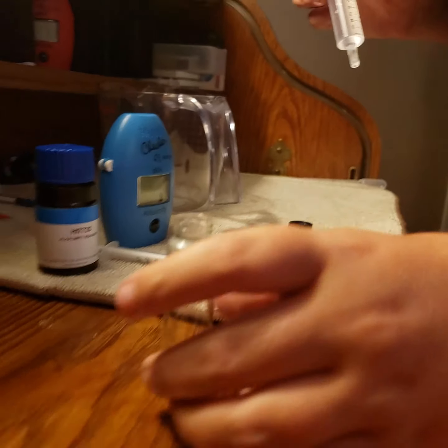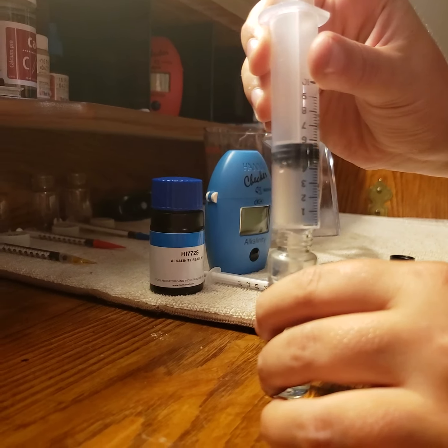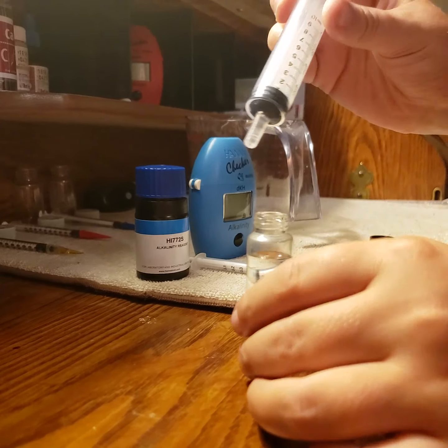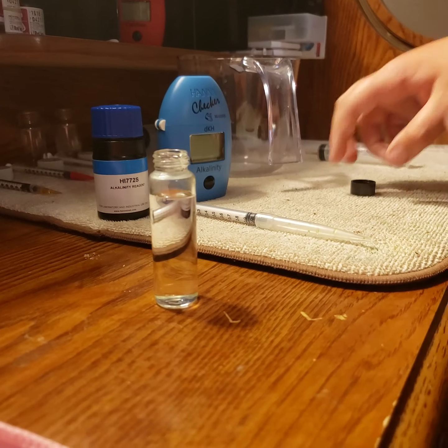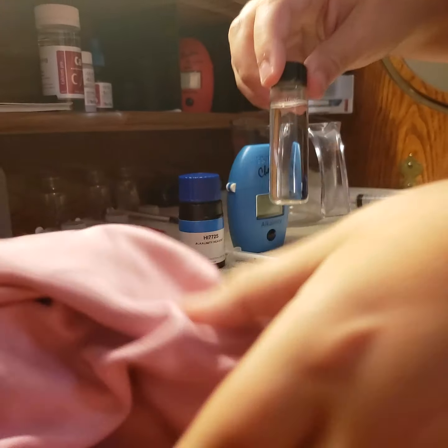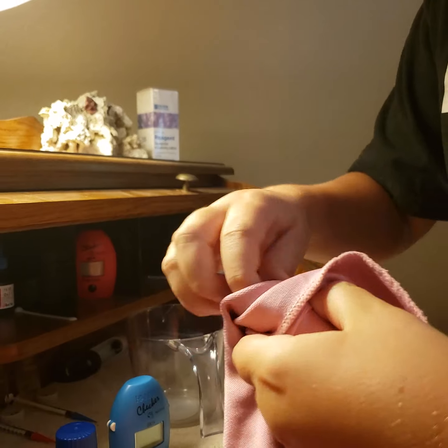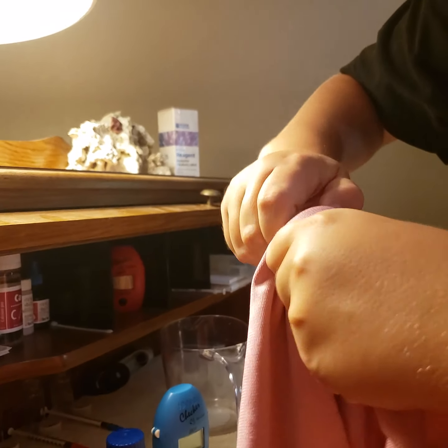All right, now Griffin is going to add it to this little glass container. He's just gonna squirt the whole thing in. He set it on the table so it's nice and steady. Next, he's gonna put that black cap on, and he's gonna wipe off all the fingerprints with this towel. You have to get all the fingerprints off because if you don't, it'll throw the results of the test. So he wipes it and wipes it.